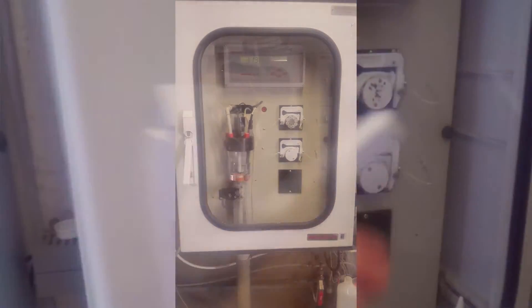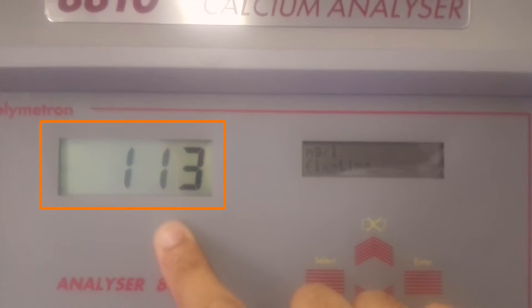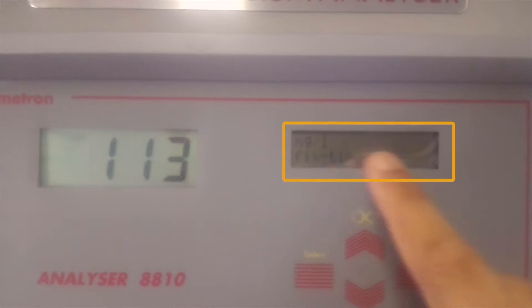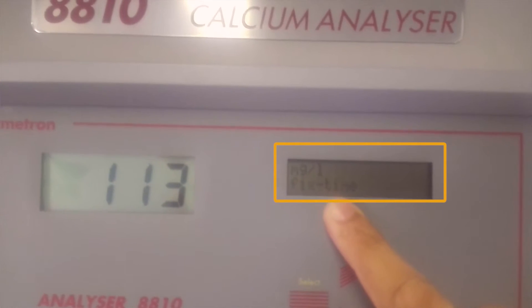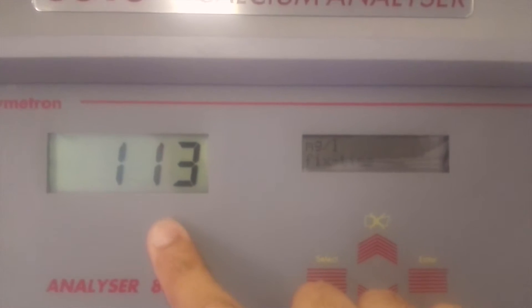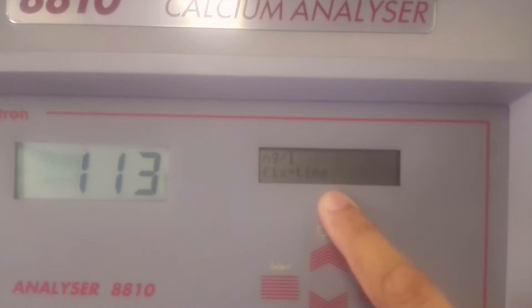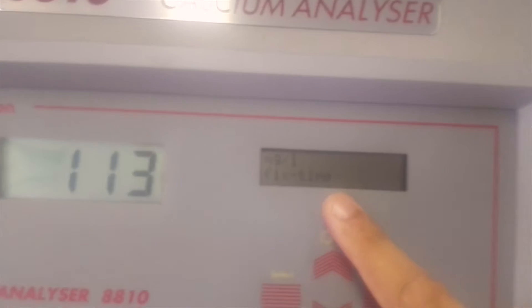This is the analyzer cabinet. Inside the cabinet is an electronic controller with dual display: one for reading and second for analyzer menu and status display. Currently, the value display is showing the last titration result. The menu display is showing the unit of concentration.